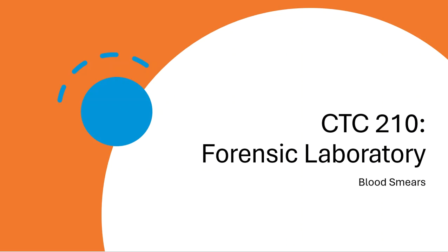All right, guys, welcome to the lab demonstration of part 2 to the blood smear videos. In this video series, you're going to see an assortment of different clips that I have done while working in the laboratory using one of our microscopes and the AmScope software.